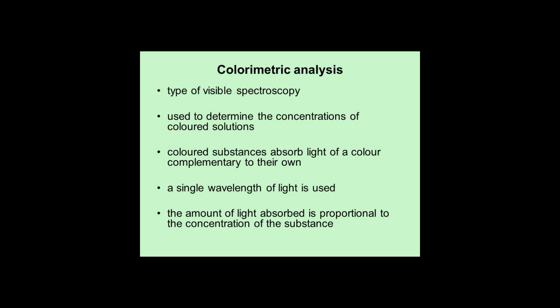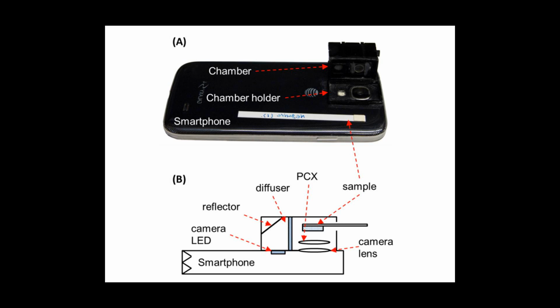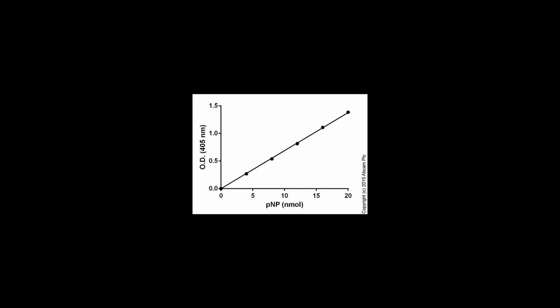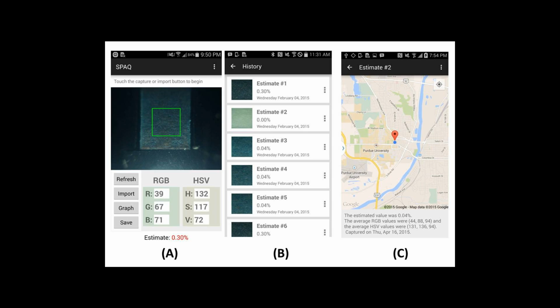Enzymatic methods. In enzymatic analysis, which is widely used in medical laboratories, the color reaction is preceded by a reaction catalyzed by an enzyme. As the enzyme is specific to a particular substrate, more accurate results can be obtained. Enzymatic analysis is always carried out in a buffer solution at a specified temperature, usually 37 degrees Celsius, to provide the optimum conditions for the enzymes to act.